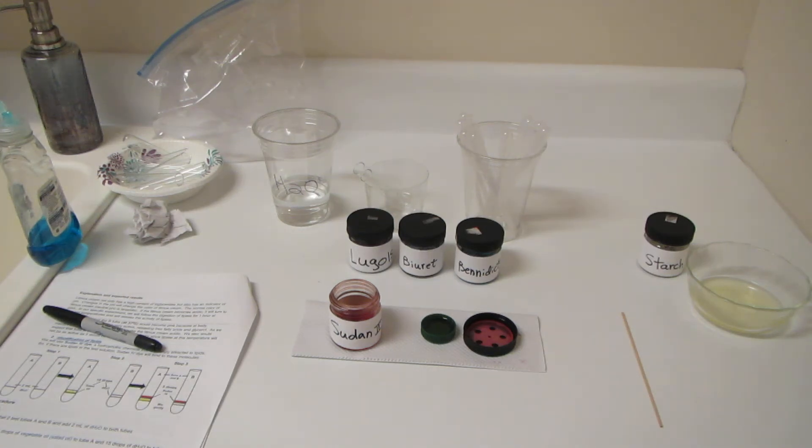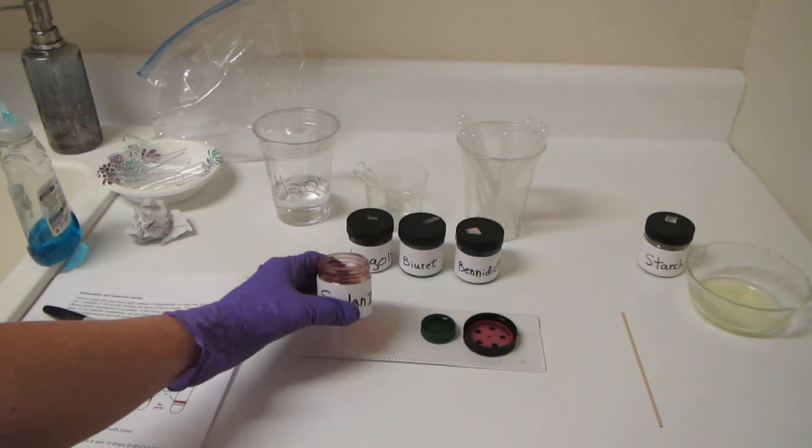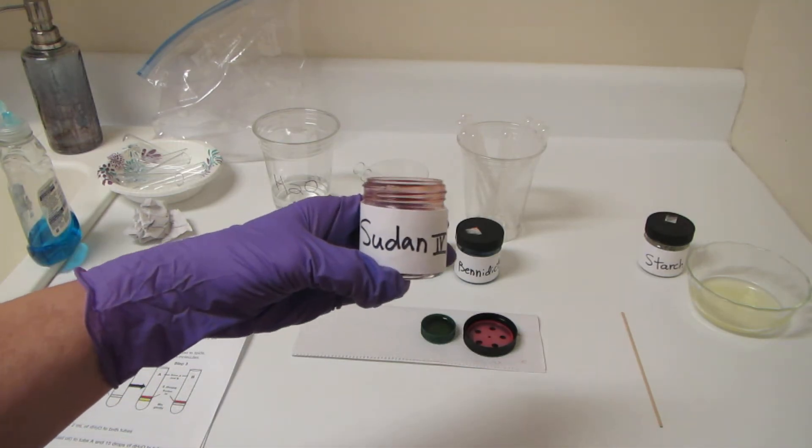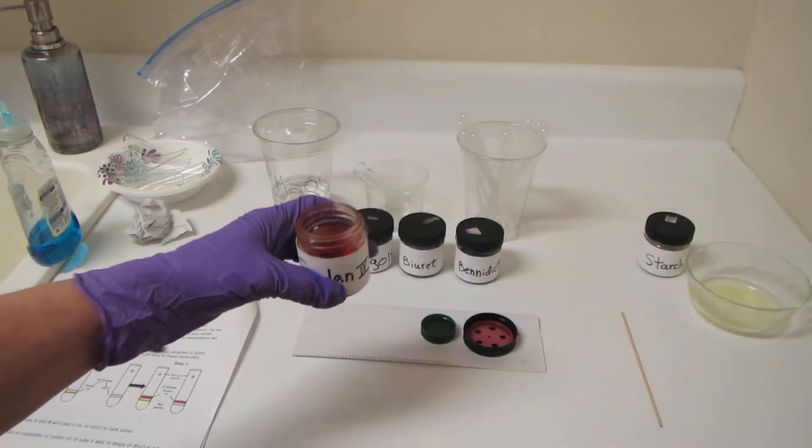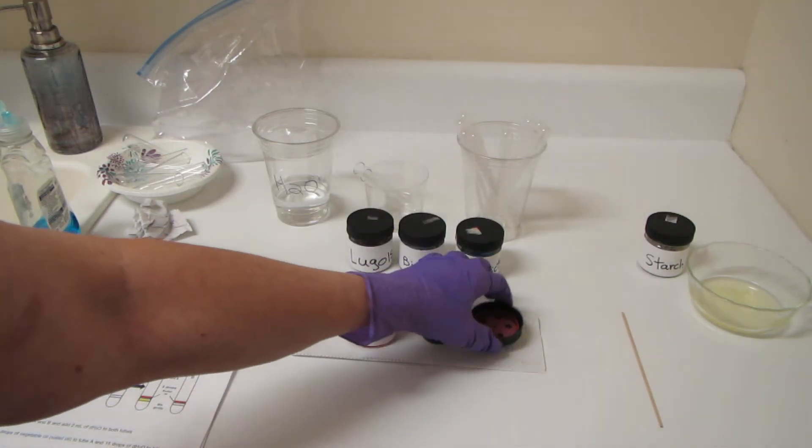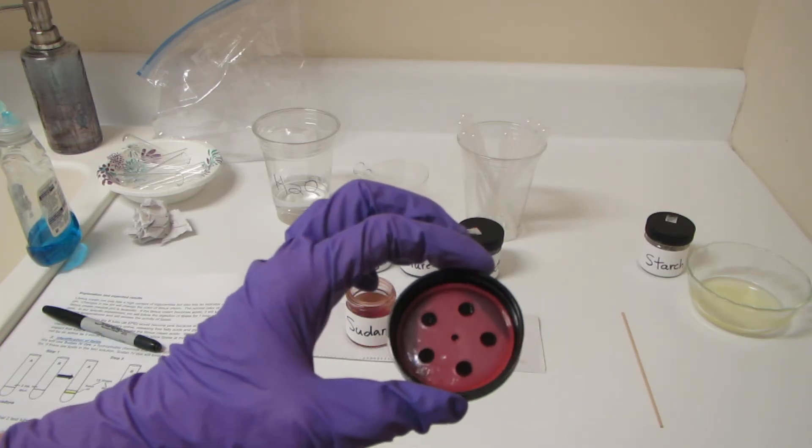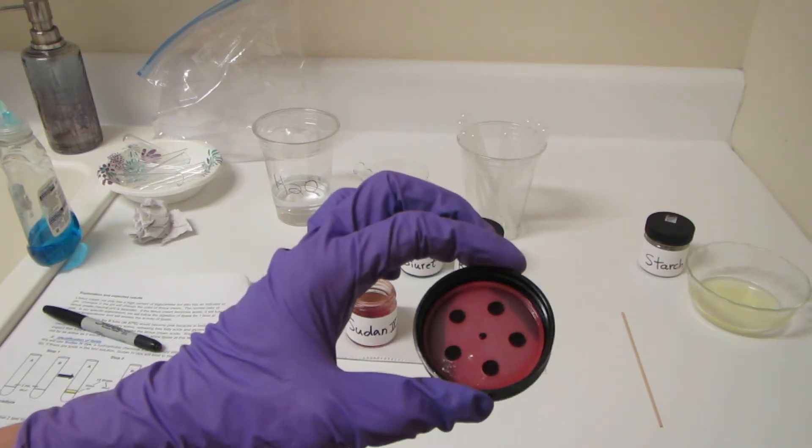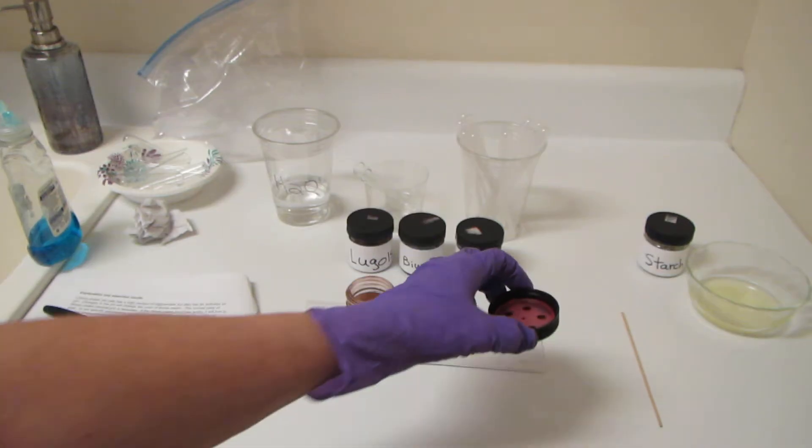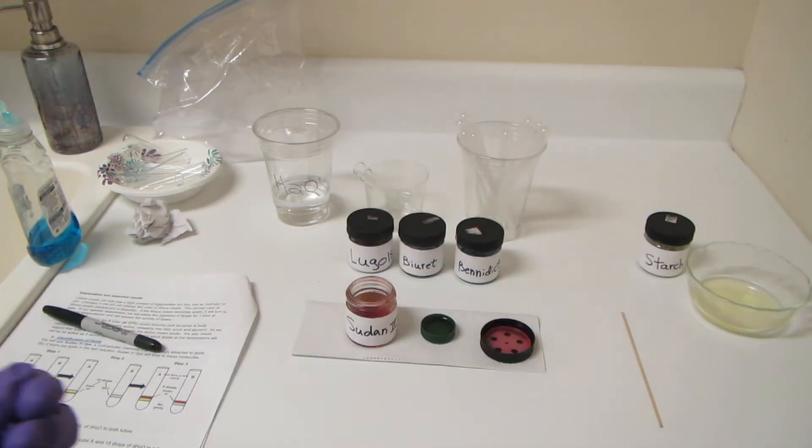Hey everybody. Let's do a little bit more digestive chemistry. We're going to take a look at Sudan 4 and how it can be used to identify fats. Here's our container of Sudan dye, and it contains this beautiful magenta dye. You can see how it dyed the white plastic this beautiful pink color here, and this can be used to identify the presence of fat.